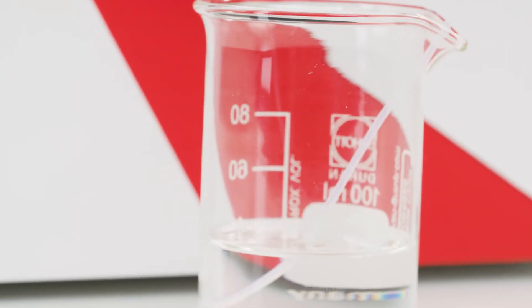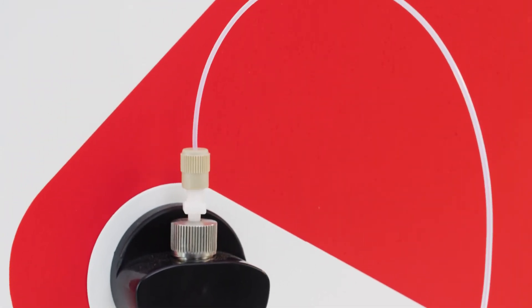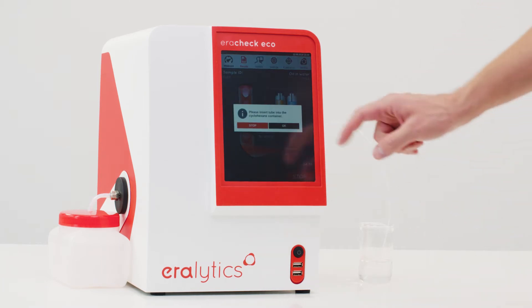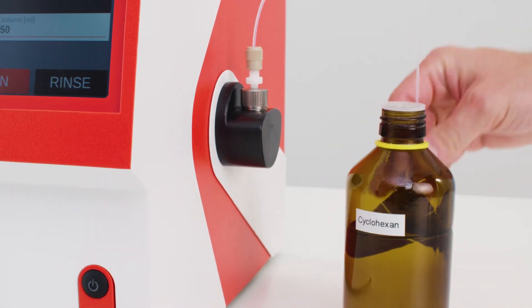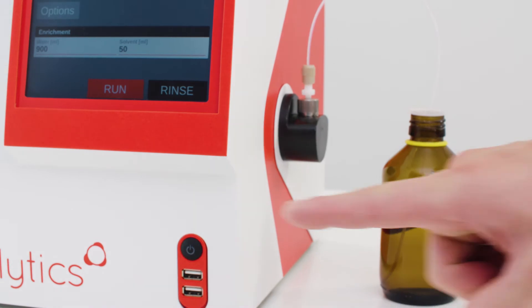AeroCheck convinces in many ways. It easily measures sub-PPM concentrations of oil in water using the CFC-free solvent cyclohexane for sample extraction. The low-cost solvent cyclohexane is the ideal alternative to CFC solvents still in use for oil and water testing.